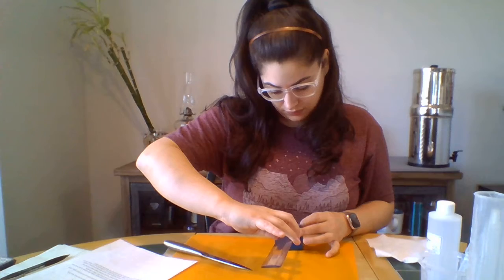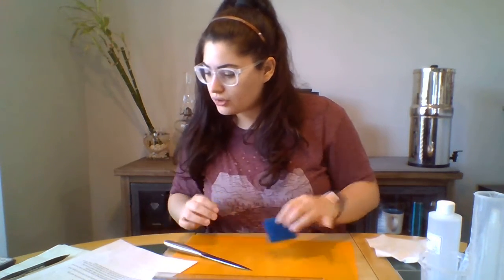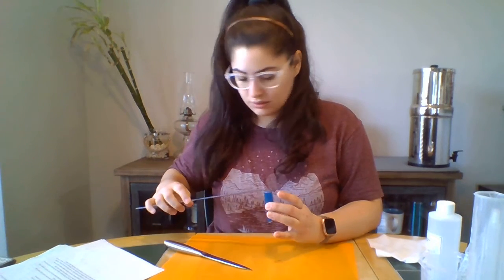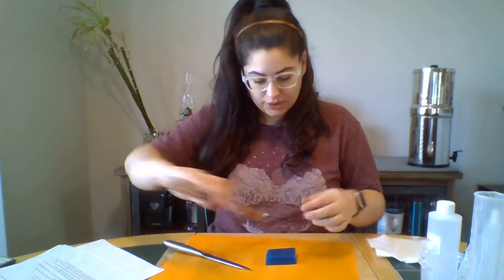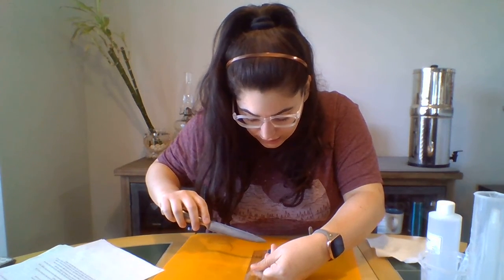So, measure. Just don't want to cut into it just yet. I want to make sure, because the other ones are 2 by 2 centimeters. And that's not quite 2. Okay, well, I'm just going to cut it this way then first. Okay. 1 centimeter.